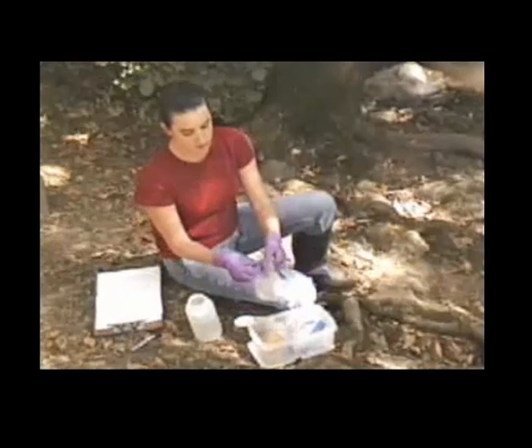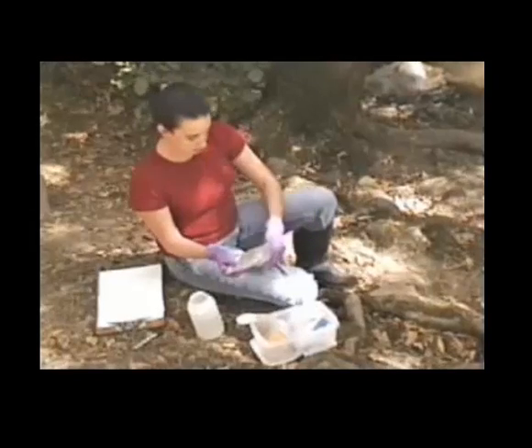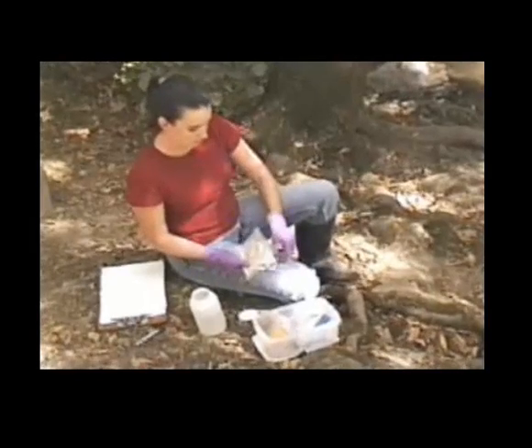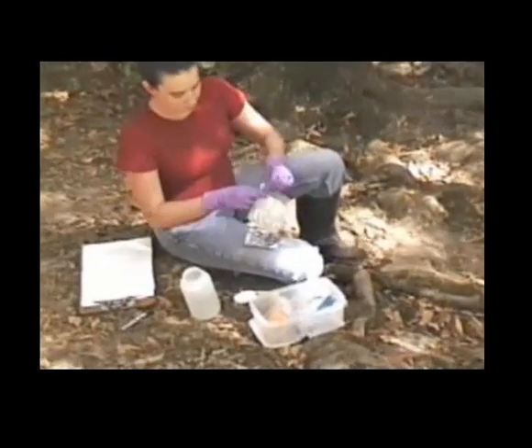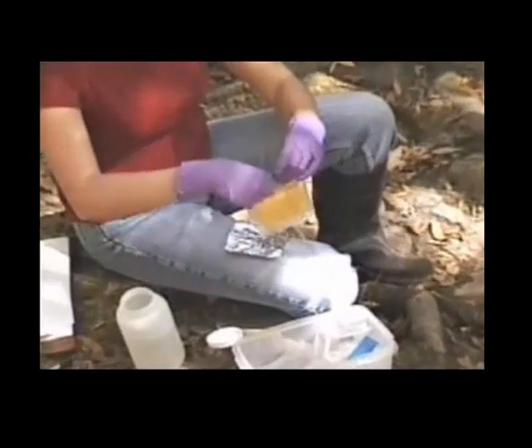Then to prepare the sample, the filter, to go to the lab, you get a piece of foil and an envelope.